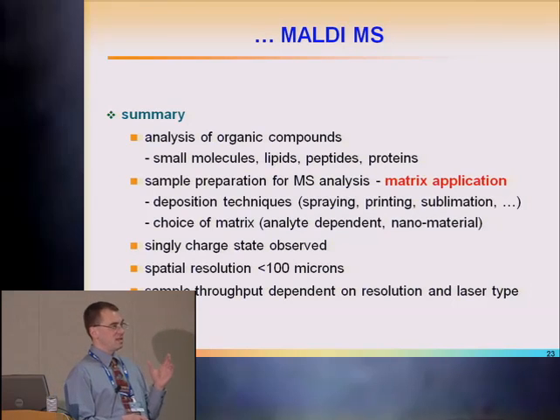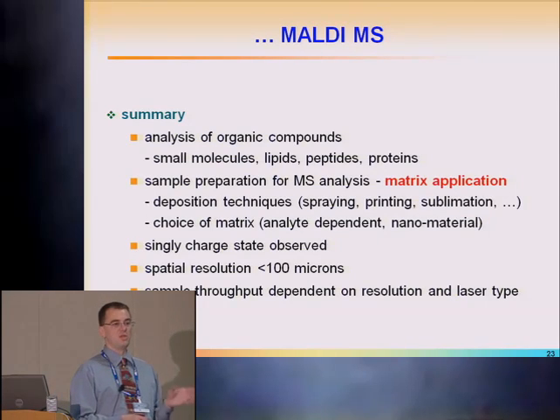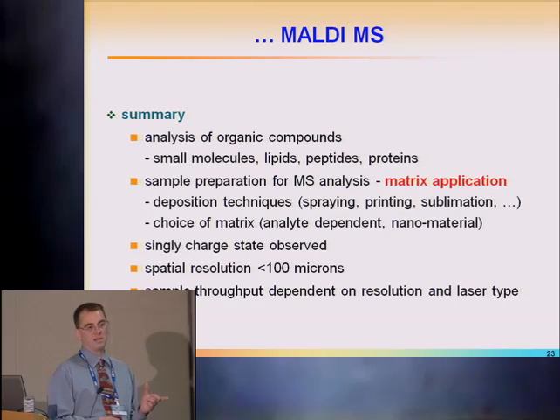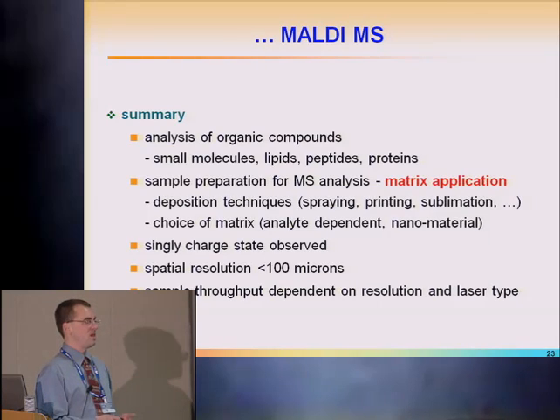The nice thing is it allows you to choose the matrix. The matrix actually can enhance the detection of certain analytes. And I think we also have to look into nanomaterial. There are some articles coming out where nanomaterials with easier application are coming forward.